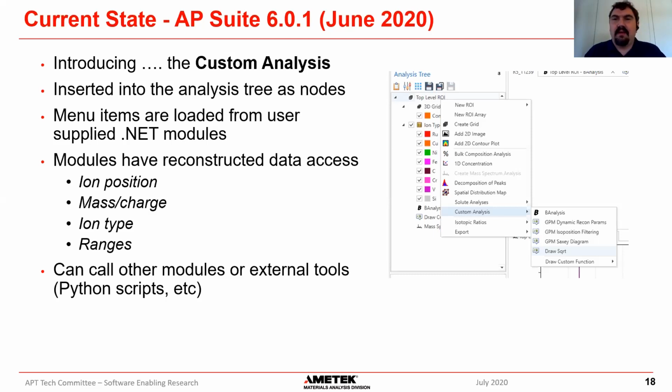And because these modules are just normal DLLs, you can call any external code you like. You could call an external Python script, all quite easily. We did try, actually, in our previous version, 6.0, having a raw C# console in AP Suite. And we've actually taken that out in favor of having these external DLLs, because it turned out that editing C# code directly in AP Suite was difficult without having all the tools available to you from an IDE, like code completion and inspection.